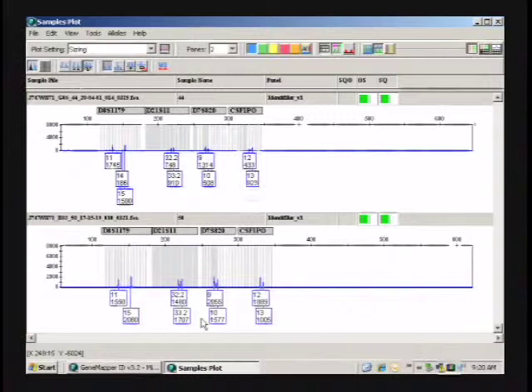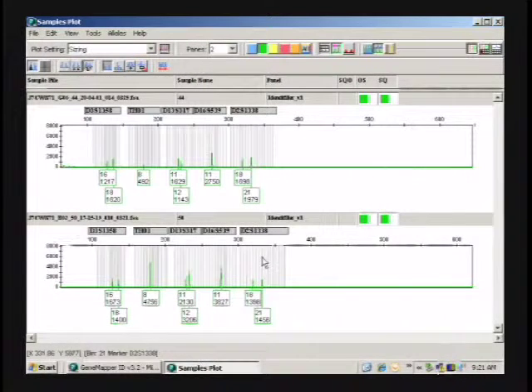So 50 was 1 wash? Oh, 50 was 1 and 44 was 2. And actually the 50 looks better in this case. Peak heights are a lot better with the 1 wash. Yes, definitely a lot better than with the 2 washes.